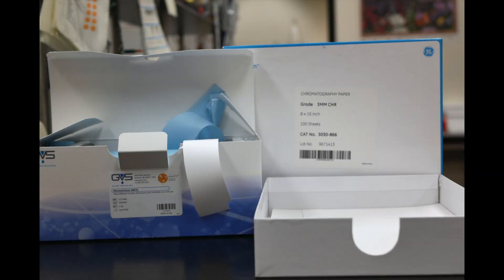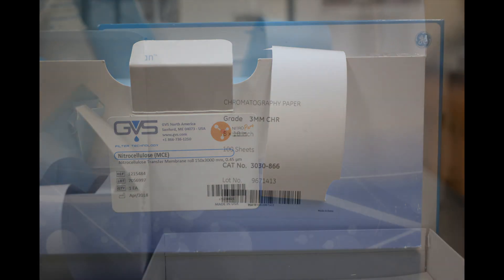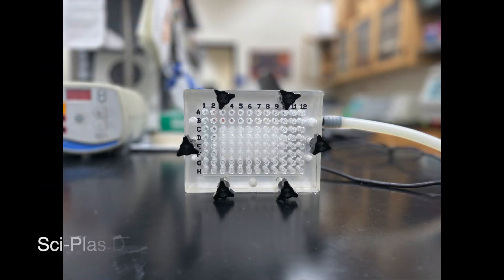The first thing we need for a Spot Western is a nitrocellulose membrane. This membrane will provide us with the medium to capture the proteins we're actually trying to study. We will also need Whatman paper, which will provide the suction needed during our protein collection step. Next we'll be using a dot blot holder used to collect our protein samples.